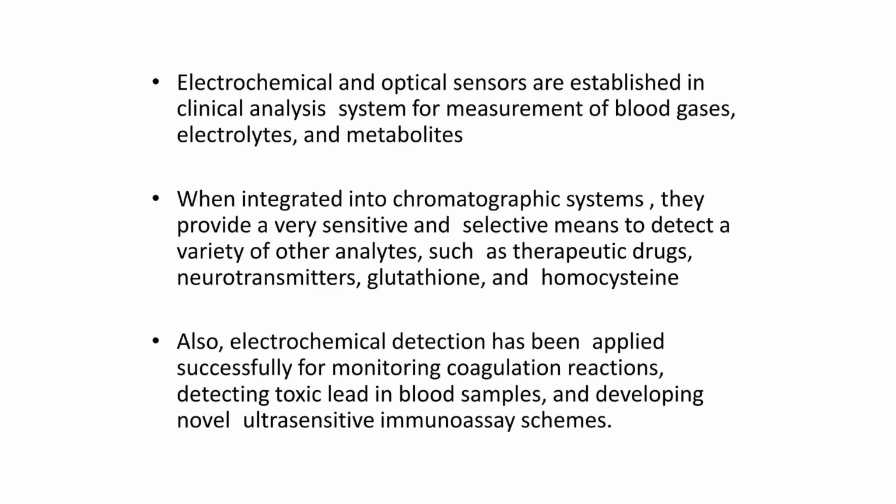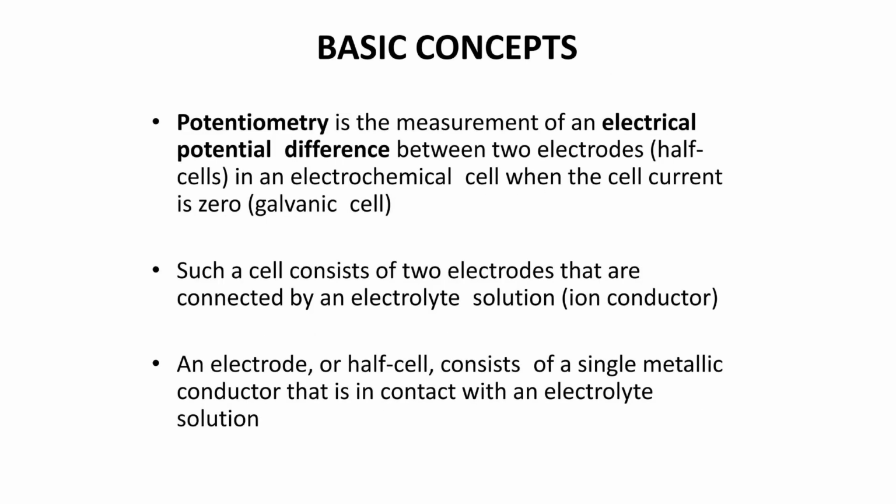In the case of liquid membrane and polymer based electrodes, these sensors utilize a hydrophobic liquid phase containing a dissolved ion exchange substance, which is structurally trapped within a porous support like PVC.